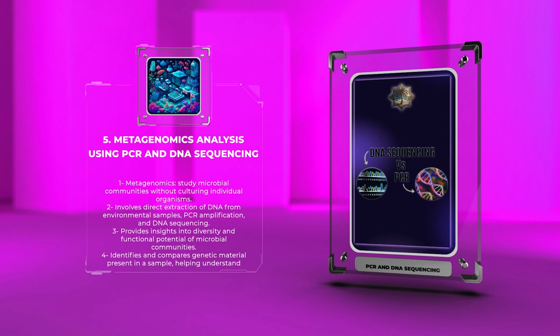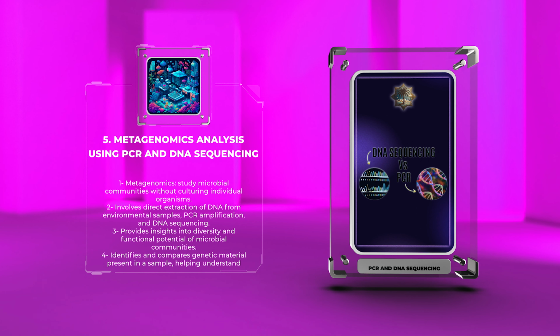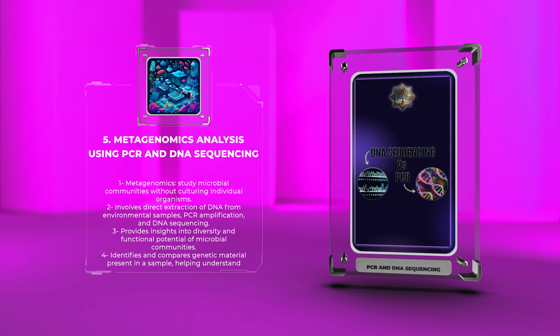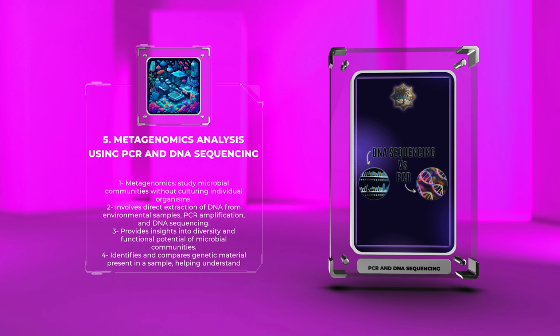novel microbial species. PCR amplification plays a crucial role in metagenomics, as it enables the targeted amplification of specific genes or regions of interest. DNA sequencing technologies, such as NGS, provide high-throughput sequencing of the amplified DNA fragments, facilitating comprehensive analysis of complex microbial ecosystems.